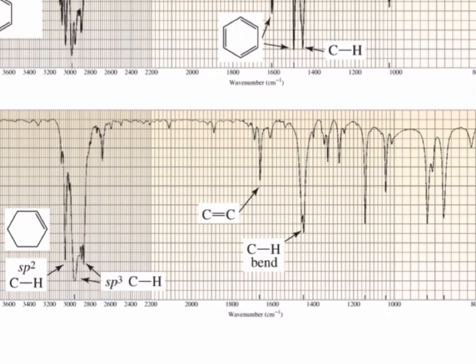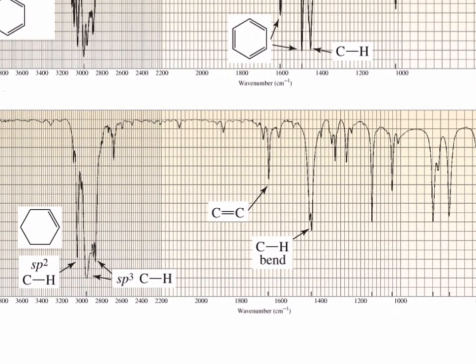We'll also take a look into the last compound. So here we do not have any methyl group in this molecule, right? So let's drop a line. Okay, on the right side of 1400, we do not see any peak close by. So the only bands that we see are on the left side, and that's going to correspond to these carbon-hydrogen bending vibrations.